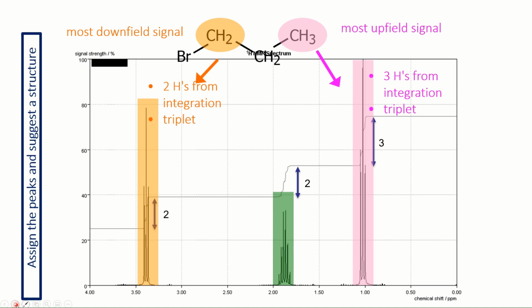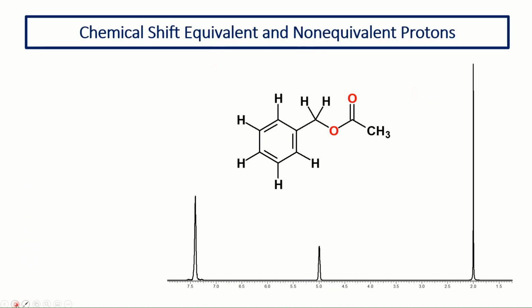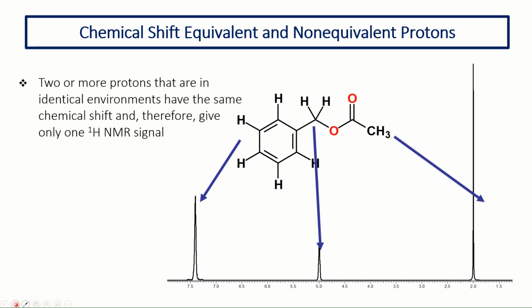The methylene in the center has 5 neighbors, 5 proton members, and that appears as 5 plus 1 peak, which is a sextet. So let's continue. So you can see here why we have 3 different types of protons at the present moment. It's a crudely resolved spectrum for this compound.